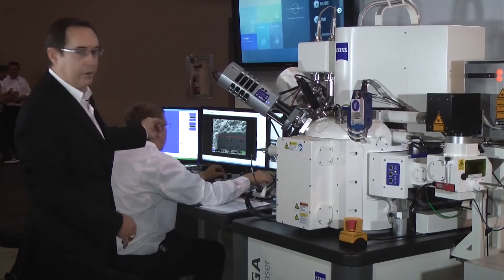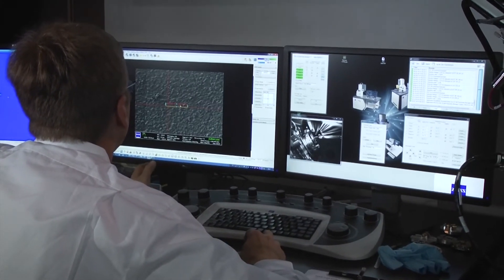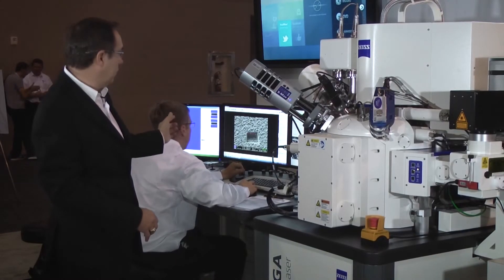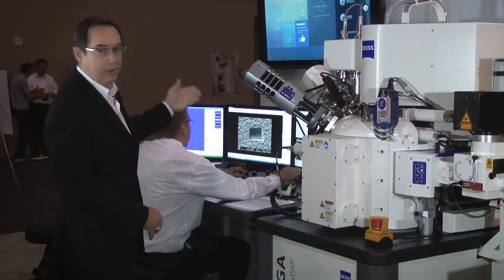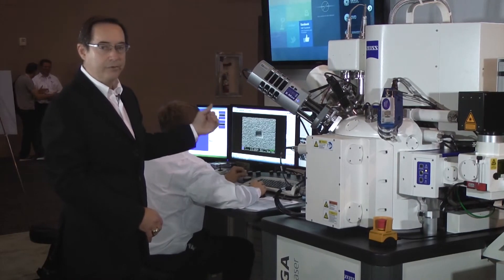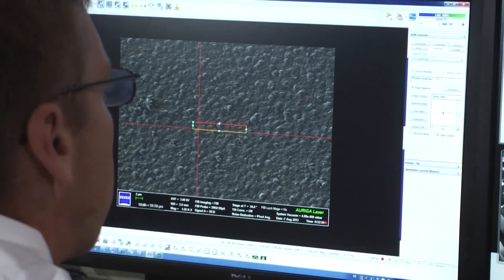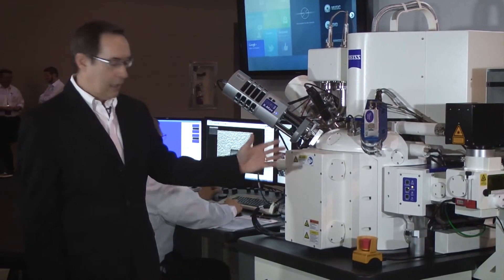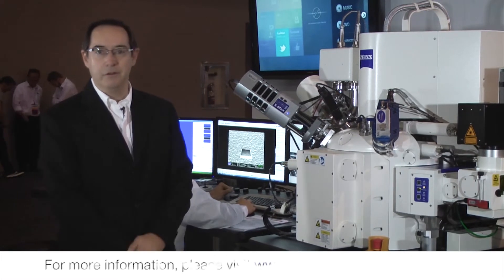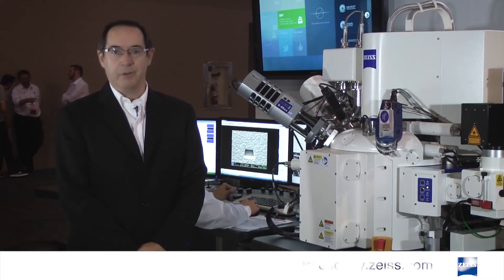You can see that we've got a cross-section on the screen over there where we have removed a very large amount of material, and now are using the focused ion beam — after using the laser — to very precisely open up a region for further analysis such as X-ray. If you'd like further information about the Auriga and the laser component on the crossbeam, please go to our website at Carl Zeiss Microscopy.